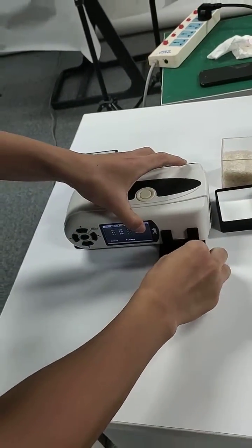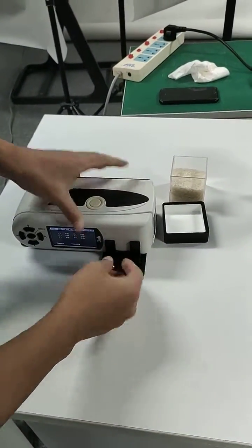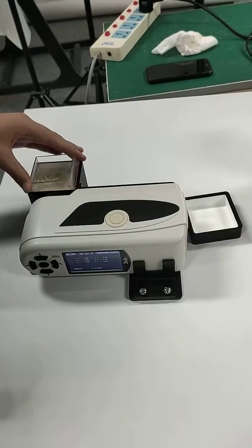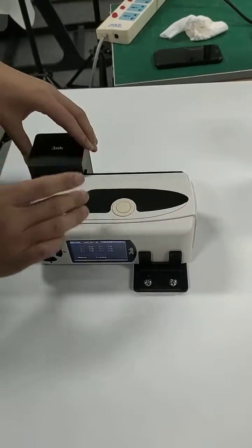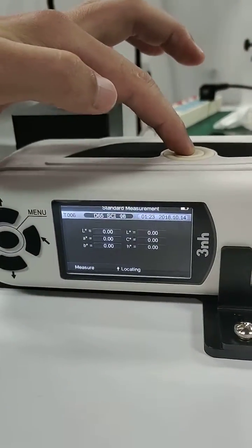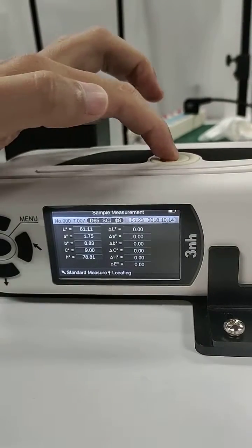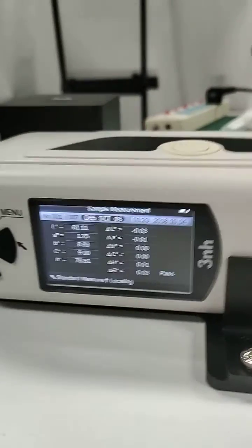Fix it, and then we put the powder sample into the cavity and cover it. We press the measure button to measure standard, and the measurement is finished.